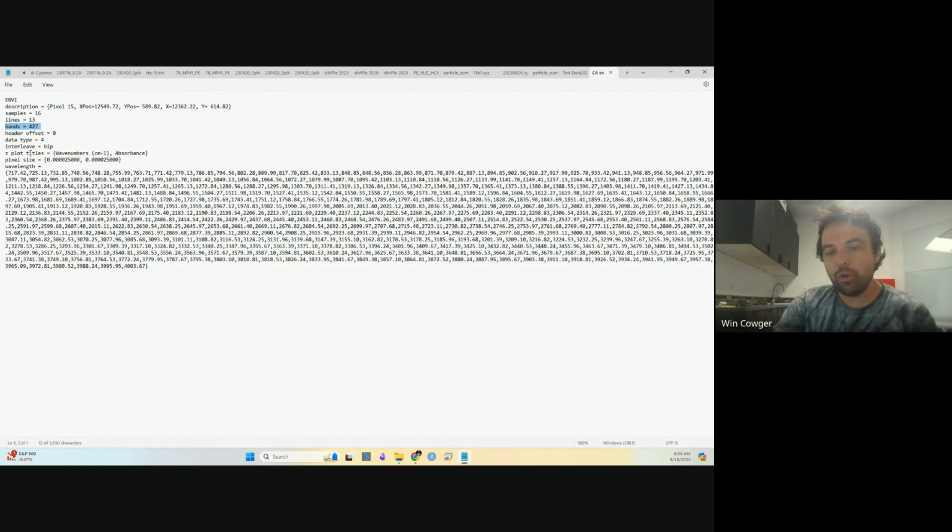If you're using your own ENVI file format and you want to paste in the chat any metadata questions that you have, go for it, and we can talk about them too, because every single instrument has a slightly different way that they format these hyperspectral images. So you're not necessarily going to have the same exact format for your machine.